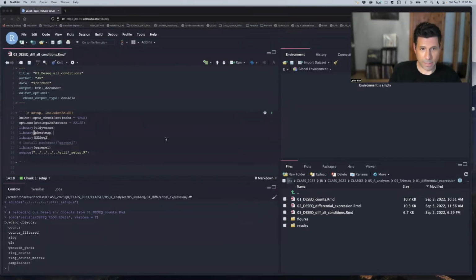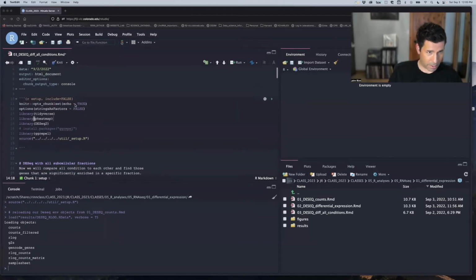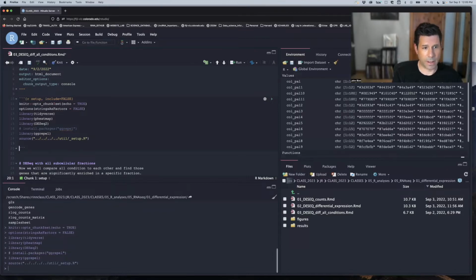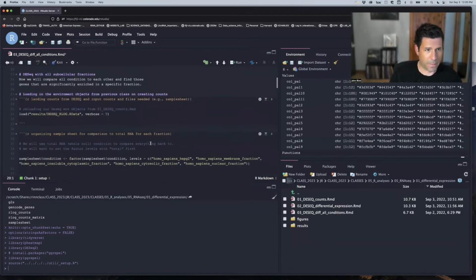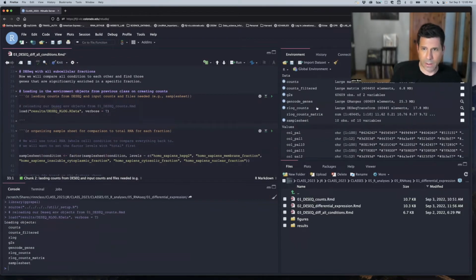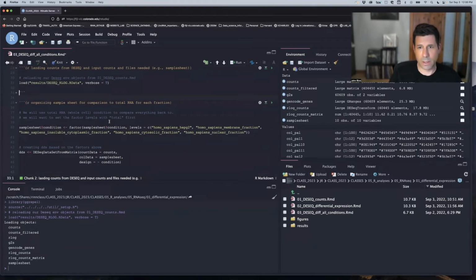So we're getting set up here. I'm on the code in my RStudio, and let's start by loading our packages and environment. We'll need heatmap, because we'll make a heat map today, DESeq, and ggRepel just to move text around. I'm just going to load my color scheme here. I believe you all have the same thing there. Then we can load our environment variables. This is so handy. All of our hard work now takes about 2 seconds to get to, and we're ready to do DESeq.